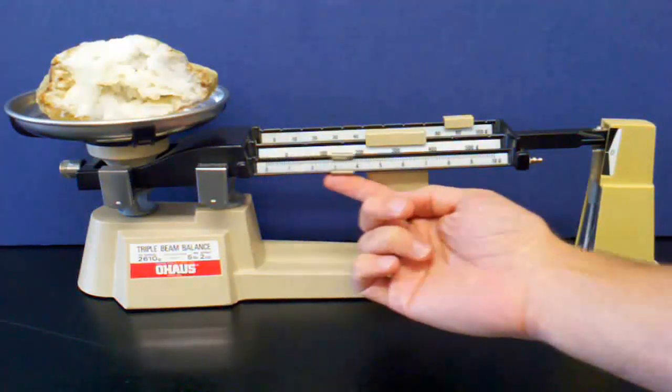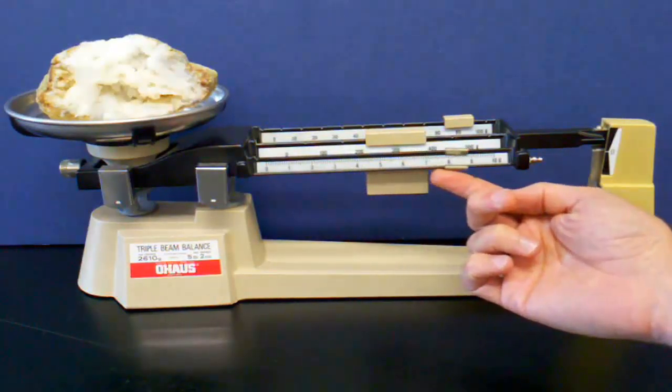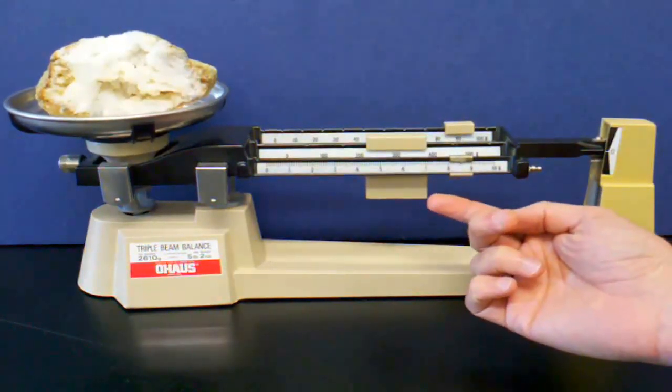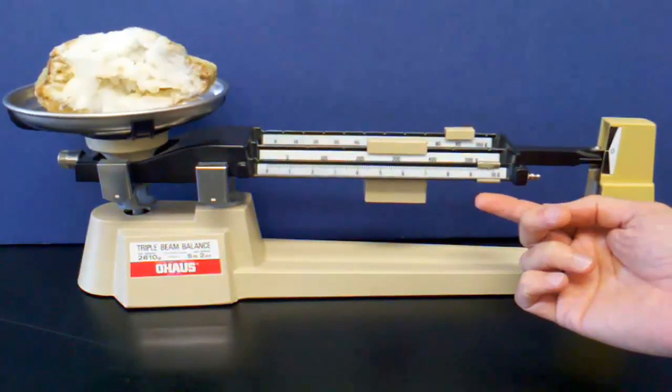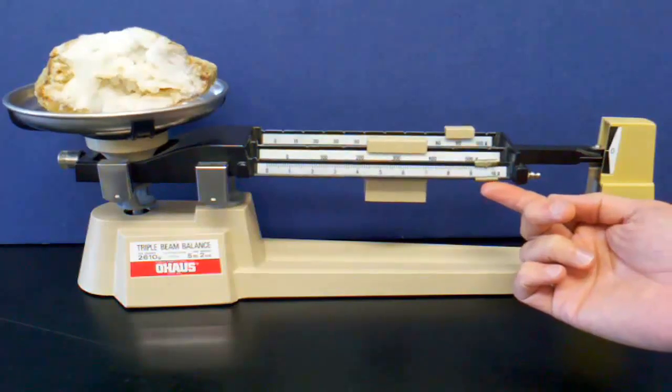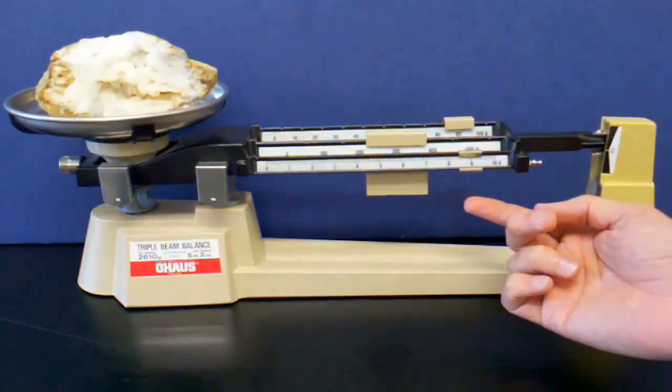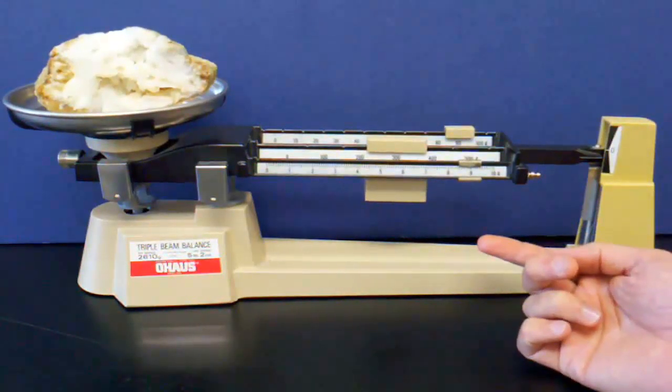Lastly, I'll do the same with the 1-gram slide. This is very delicate, and I slide it carefully along the rail. I may need to adjust it back and forth until the balance will point to the zero.